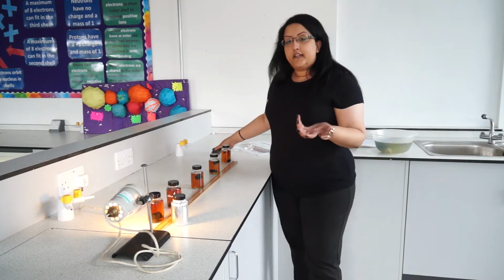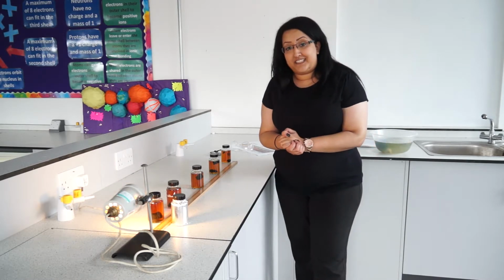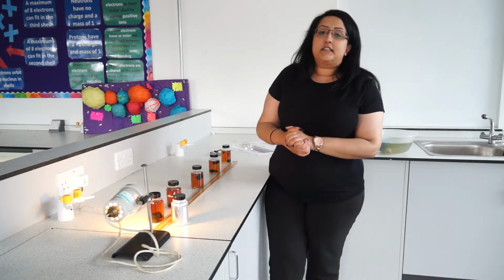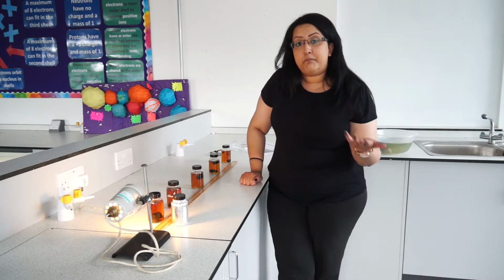Now, you have to wait for approximately a minimum of 45 minutes, preferably 60 minutes. So your teacher may ask you to set this up at the start of the lesson and, at the end of the lesson, come back to it.